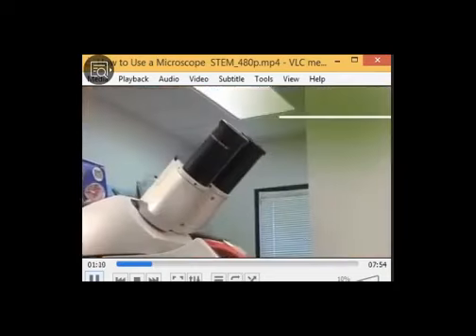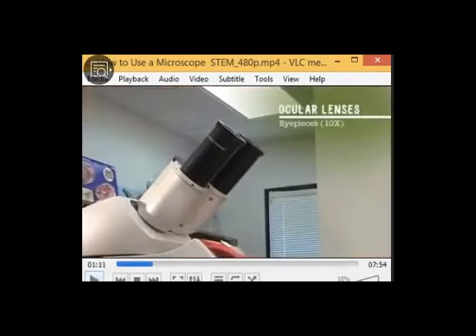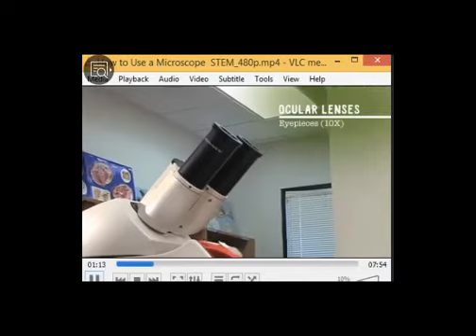So the microscope is a machine. This machine has got two lenses. One is this, what he is showing, called the ocular lens. I showed you last time. Ocular lens, also called eyepiece. So this is one lens that has a fixed magnification power, which is 10 times. We cannot change it. This is one type of lens.